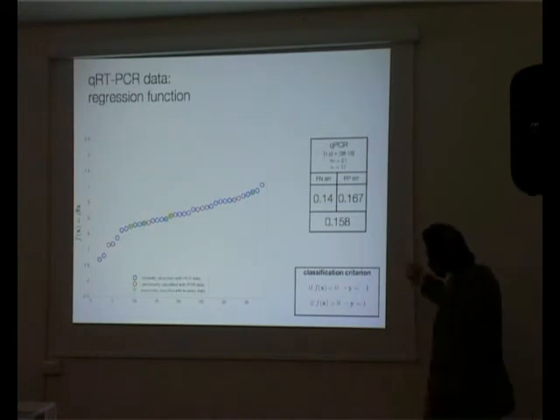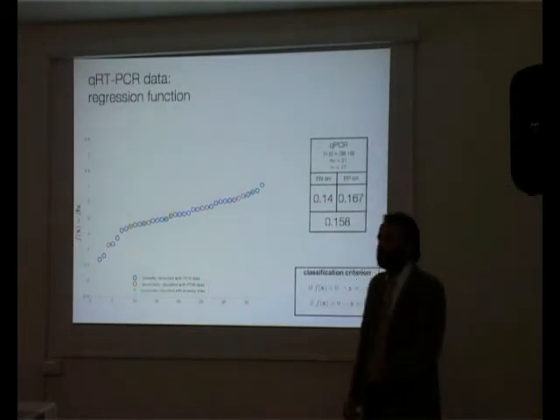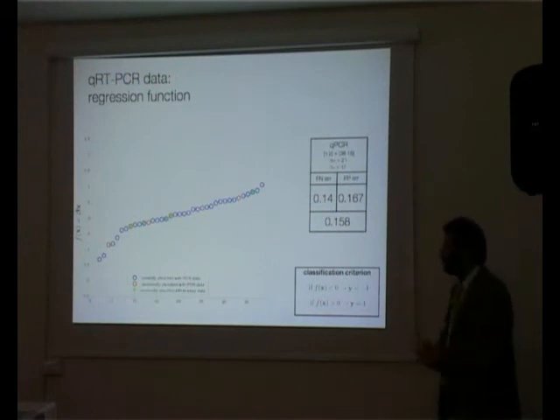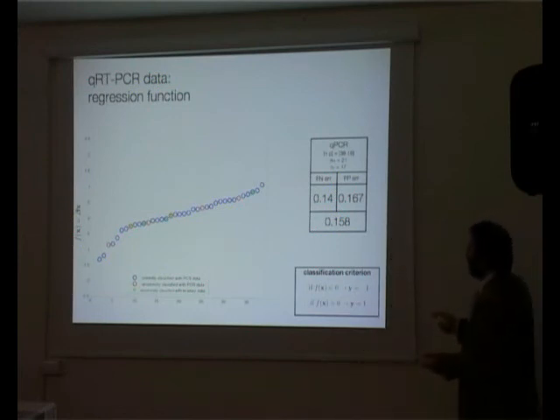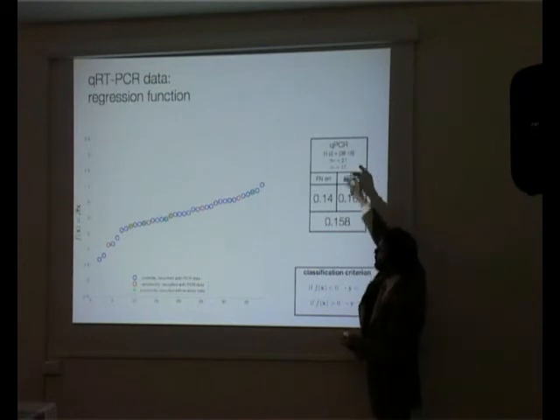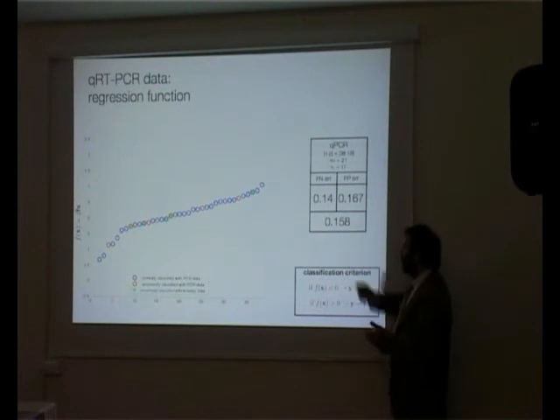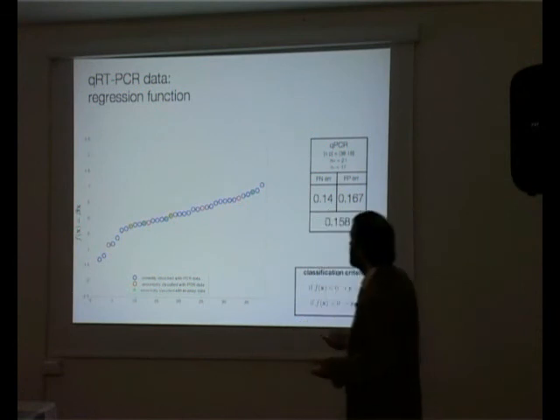Right. So I think the interesting bit is that the prediction ability of the real-time PCR is slightly better than with the microarray, but in the same ballpark, I would say. So I wouldn't be too picky, just 1 against 2. These figures are at the limit of statistical significance, but they are, I would say, safely below chance, right? So the two sets in this case are almost 50% apiece. And so it's an interesting result, and in line with what we were expecting.